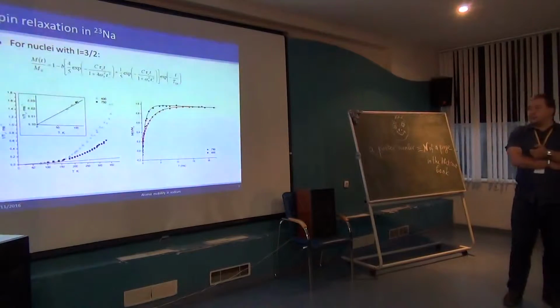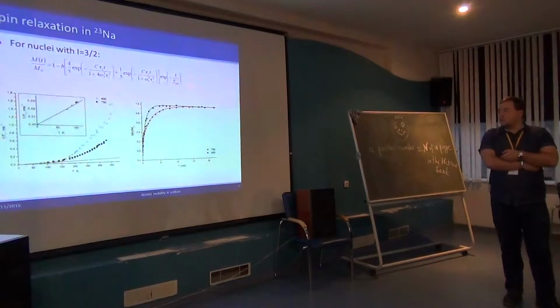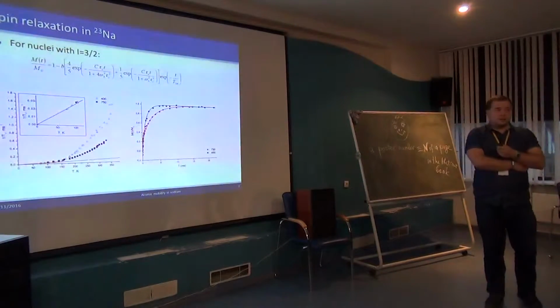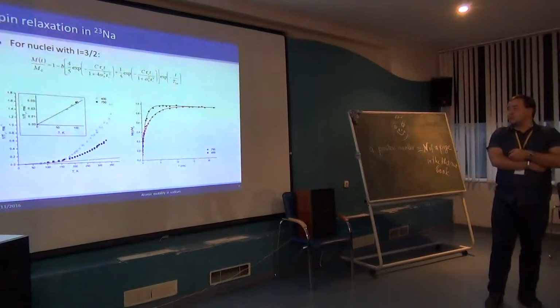In general, the first possible approach is to believe that there is no strong dependence of this relaxation time on confinement. But yet, there is a more exact solution which could be used in order to determine this value.